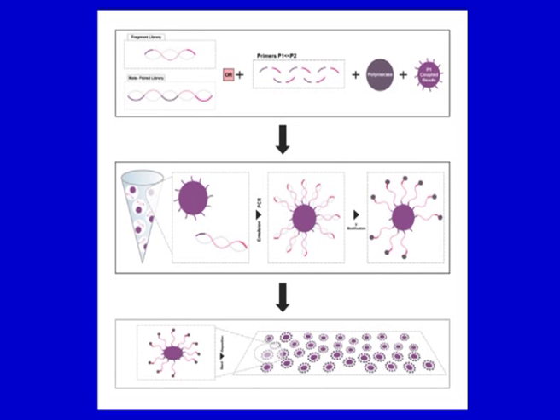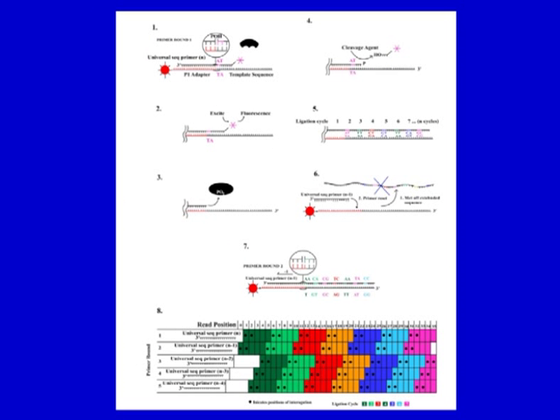So, this is how this reaction is carried out. These are beads on which the DNA is attached and PCR is carried out, and this is the real reaction here where priming and ligation are the 2 methods. If you can see on the screen, there is an adapter and there is a primer against that. Now, this fragment, which is the probe you can say, has a fluorescent material in here. So, this will be matching, and after the primer it will sit in here, and these are various probes in here.